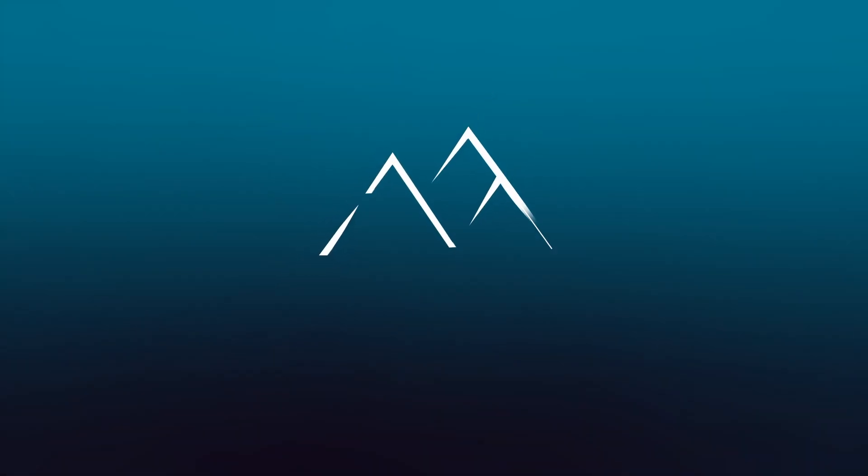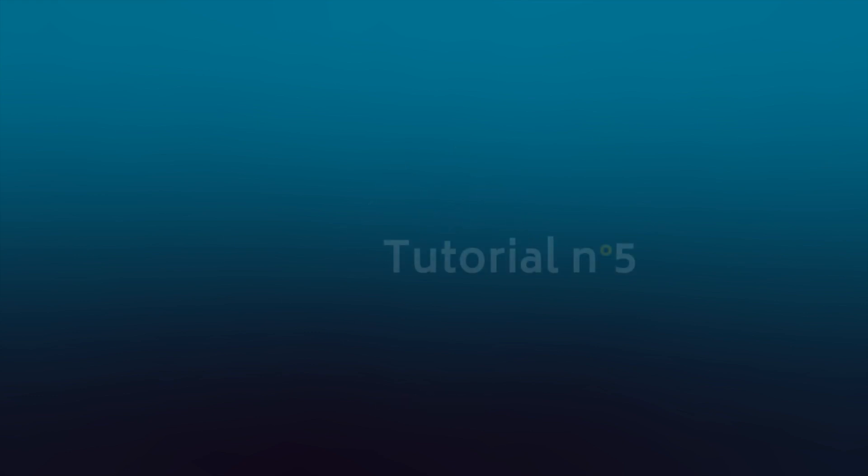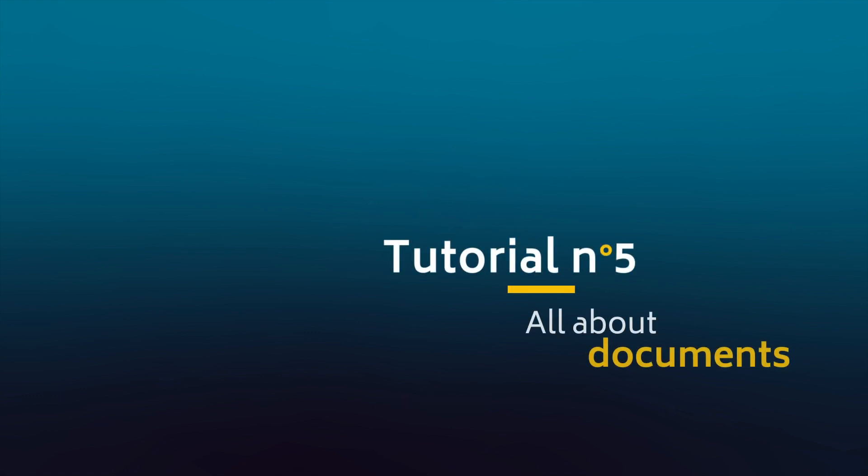Hello and welcome to the fifth video in this tutorial series on MOUNTAINS, DigitalSurf's industry standard software for profiler and microscope data analysis. In this video we're going to take a closer look at the MOUNTAINS document and learn how to customize it.